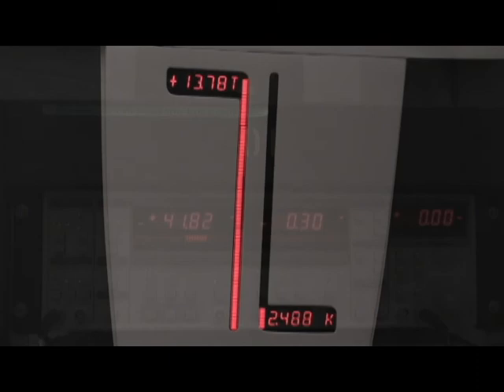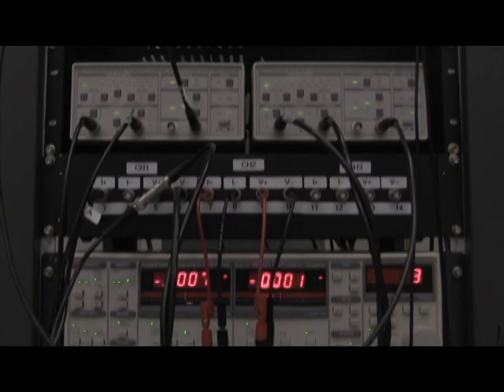We use a variety of instruments to measure the properties of our crystals as a function of temperature, magnetic field, and other variables.